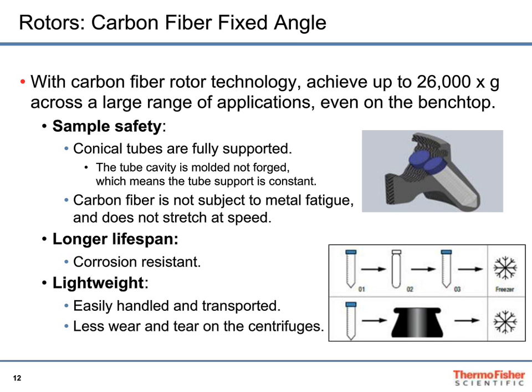What happens in ventilated is the centrifuge is designed with ports in it to suck in the room air and have that essentially cool, whip around inside the chamber, and then go out another direction, and essentially become a type of fan mechanism that pulls in ambient air and then cools the chamber, because the rotor running in there at any speed is going to create heat and push that away. So typically, your samples can be in these air-cooled centrifuges, ventilated centrifuges, and never see much more than a 1 or 2 degree rise. And now there can be cases where people are running them very hard.